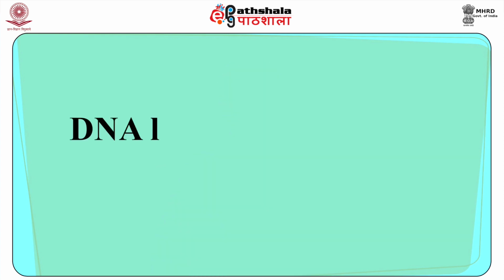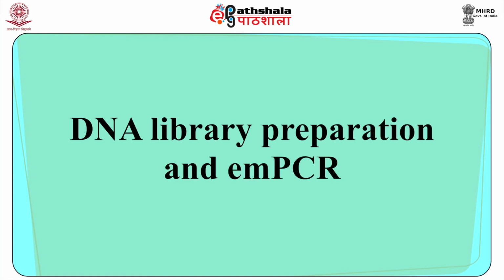Pyrosequencing has several steps. The first is DNA library preparation and emPCR. Genomic DNA is fractionated into smaller fragments of 300 to 800 base pairs, and sticky ends are converted to blunt ends. Short adapters are then ligated, which provide priming sequences for both amplification and sequencing of the sample library fragments.